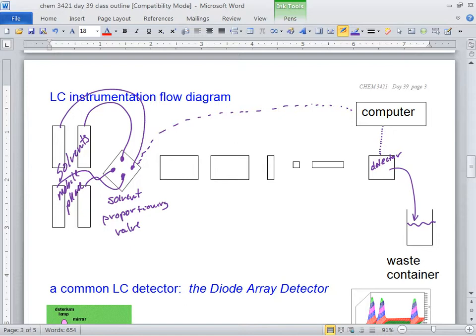Right now, again, it's odd that we can put guys on the moon, but we can't think of anything different than this to push liquid through, right? So it pushes through, then it sucks some up, and then it comes back, sucks some more up, and pushes it through. It has this double piston thing going with little valves in between. But the point is that's your pump.